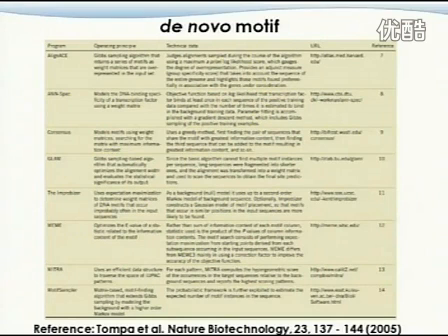But the point here is you want to take precaution that most of those algorithms were not developed for ChIP-seq level data, because with ChIP-seq we get thousands or sometimes 10,000 enriched regions, and those algorithms probably handle up to a few hundred fragments, and that will be fine. It's not like their math doesn't work when you go to 10,000 regions.